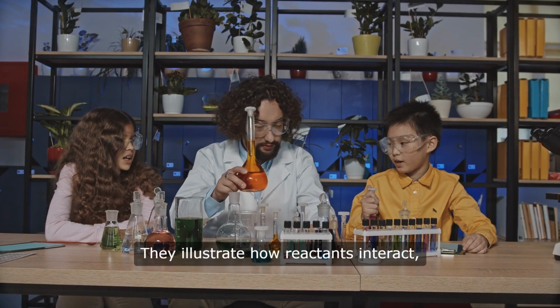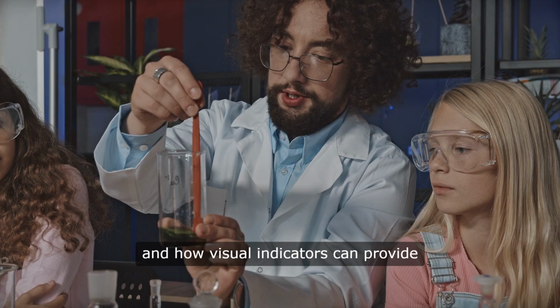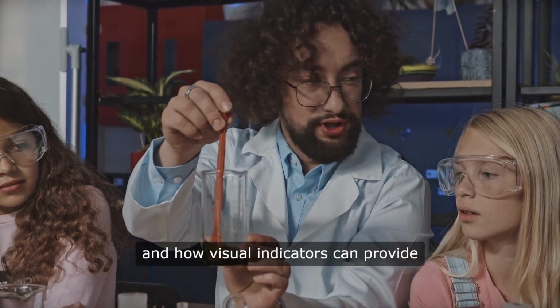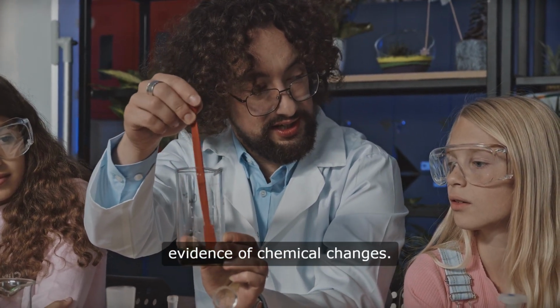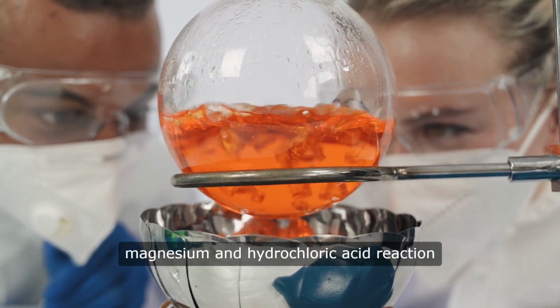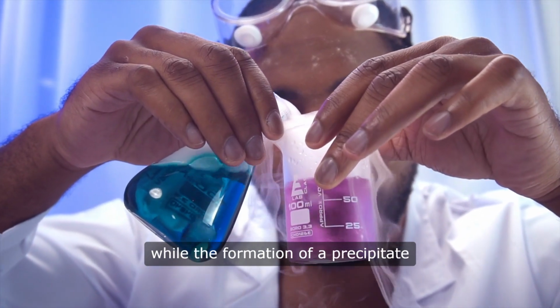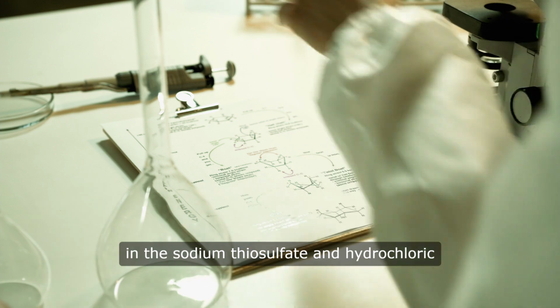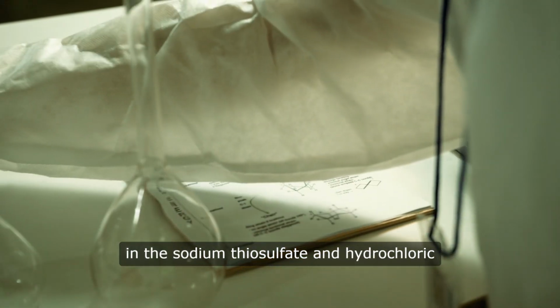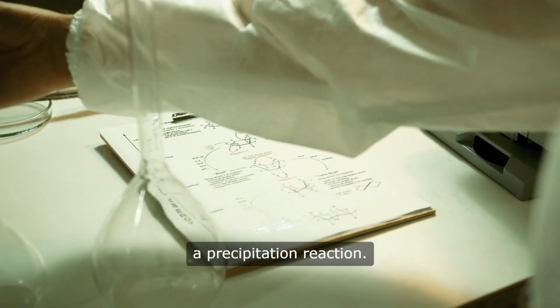They illustrate how reactants interact, how reaction rates can be manipulated, and how visual indicators can provide evidence of chemical changes. The production of hydrogen gas in the magnesium and hydrochloric acid reaction exemplifies a gas evolution reaction, while the formation of a precipitate in the sodium thiosulfate and hydrochloric acid experiment demonstrates a precipitation reaction.